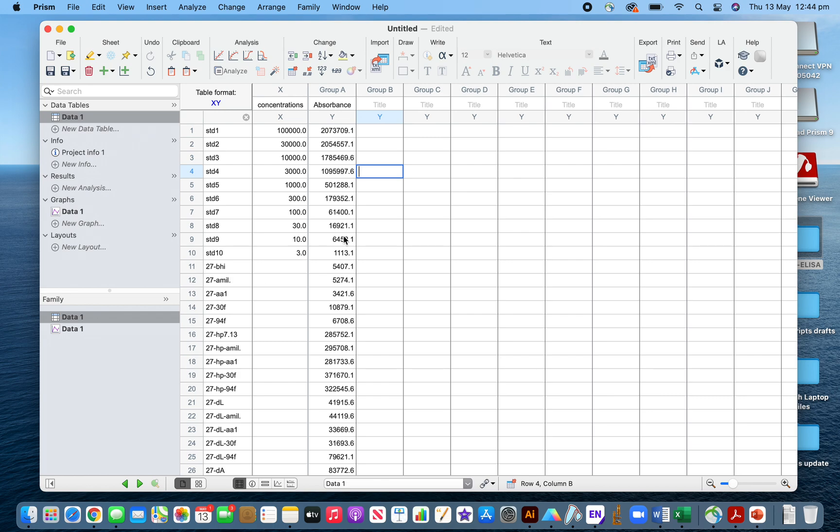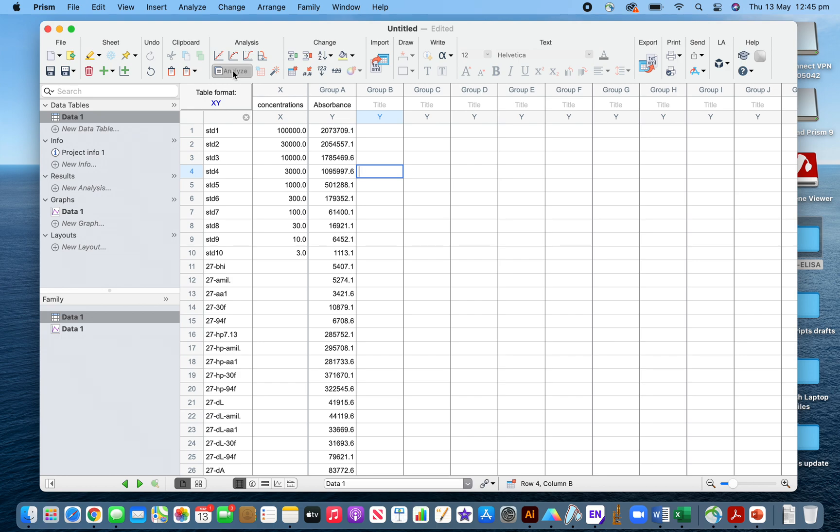Now, what to do for calculating the concentrations of the unknown samples from the interpolating analysis? First you have to transform the x values, the concentrations of the standard values here.